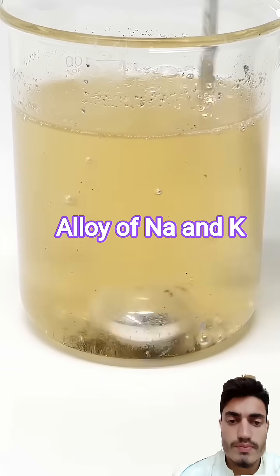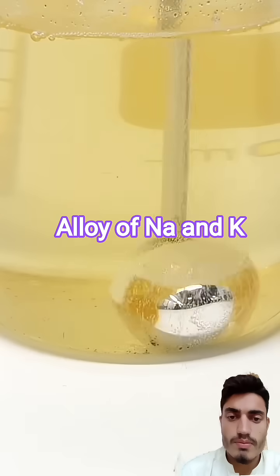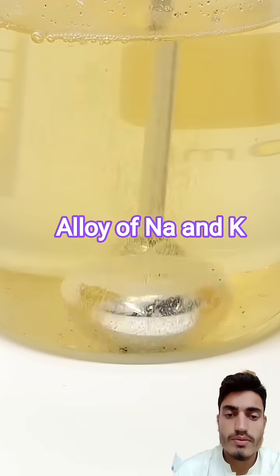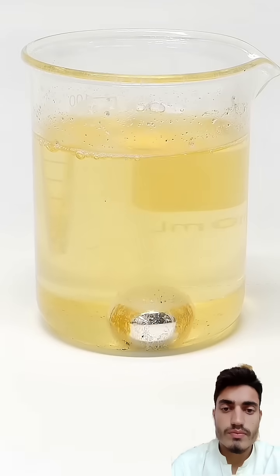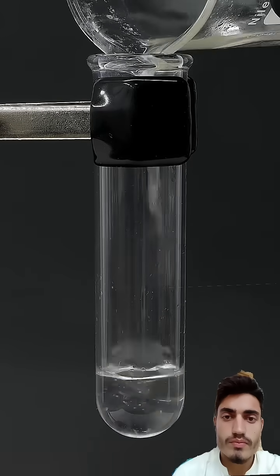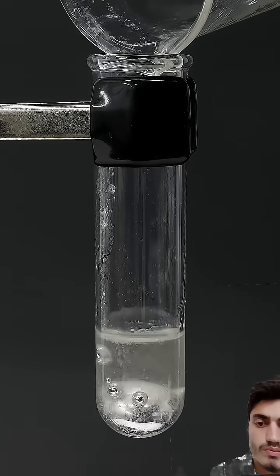I stirred this around for another couple of minutes, and I eventually had a perfect ball. I poured off almost all of this dirty yellow kerosene, and I transferred it to a test tube with some fresh kerosene.